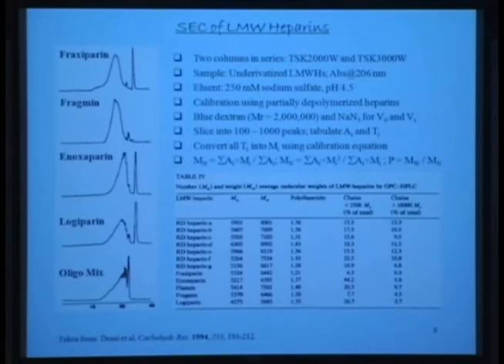So all disaccharides would appear somewhere here. And I think I used the average for differentially sulfated molecular weights for this. And the retention time arises from here. And that's how the whole thing is calibrated. Okay? So you had a question. Yeah, good. Explain Mn and Mw.